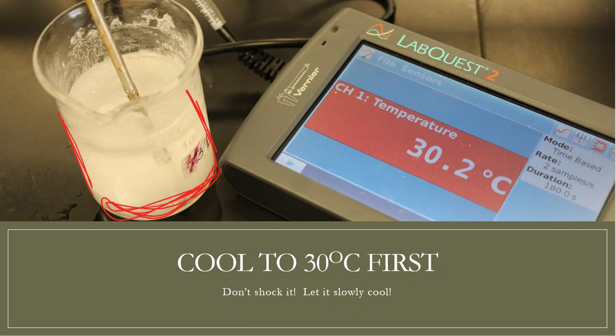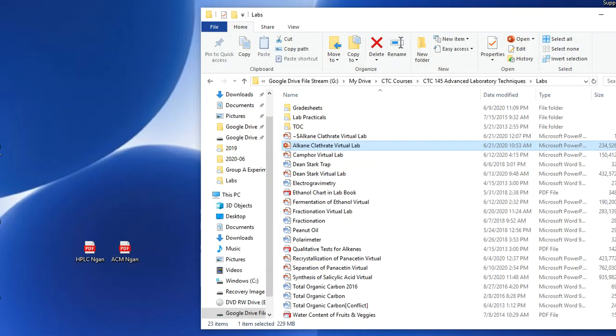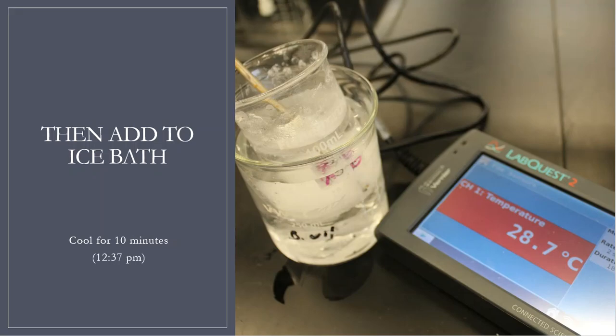We don't want to shock it with the ice bath temperature because I could get some impurities and some other things that begin to fall out if I'm not careful. So again, I want to take my time. Patience is a virtue, and patience is going to be a virtue here as well. All right, so I then take that beaker, the entire thing, and I dunk it down into some ice water. And that temperature is going to initially read 28.7, and this begins to happen at 12:37 p.m. So this will give you a time stamp at least to let you know how long I did keep it in an ice bath before I took it out.